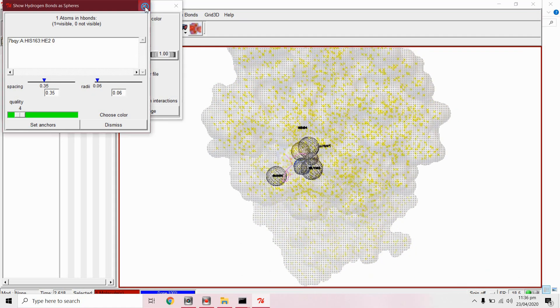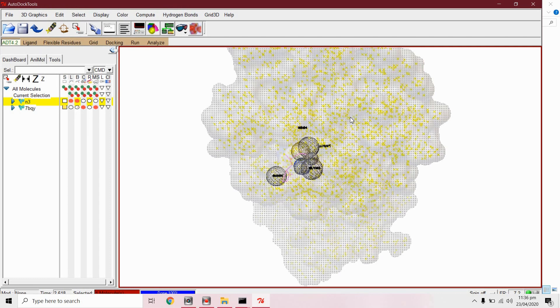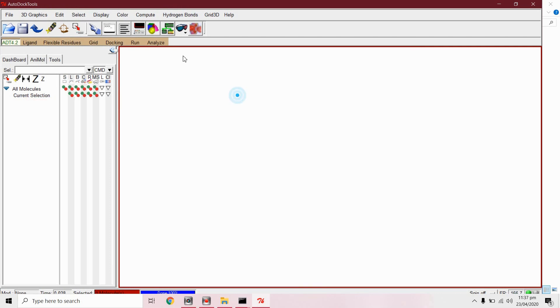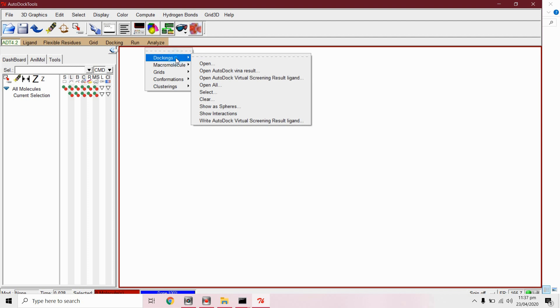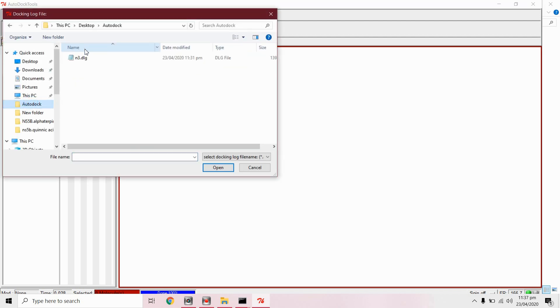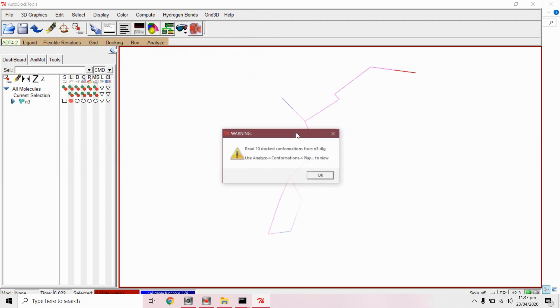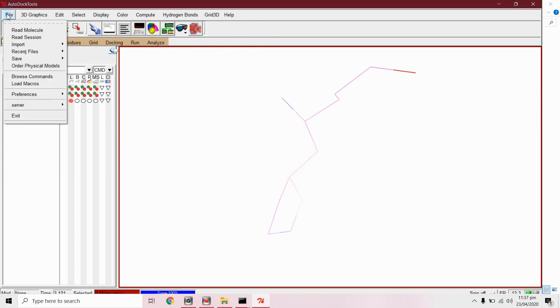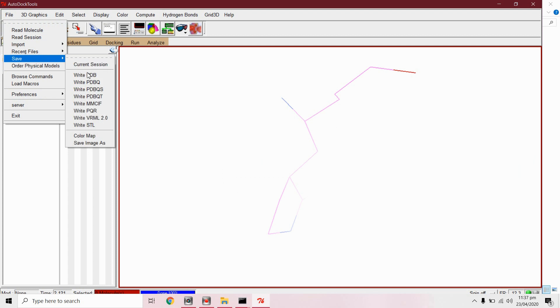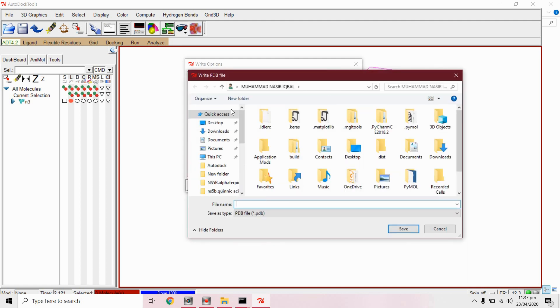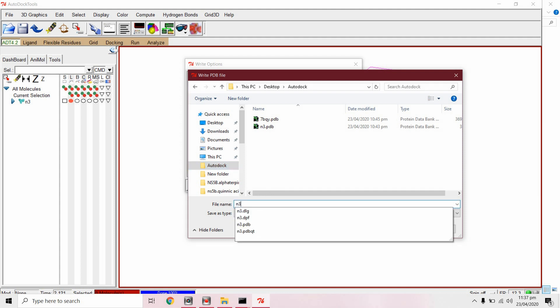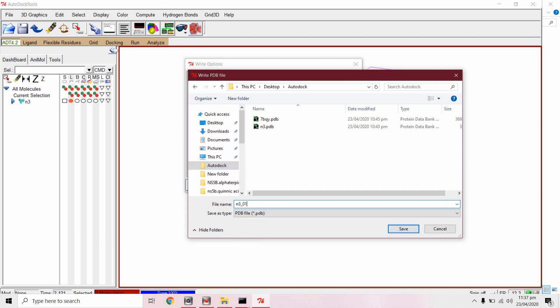We can also analyze these results by using PyMOL. Now from analyze docking open this confirmation file log file. Now from file save and write PDB. Browse this AutoDock and it is N301.PDB.